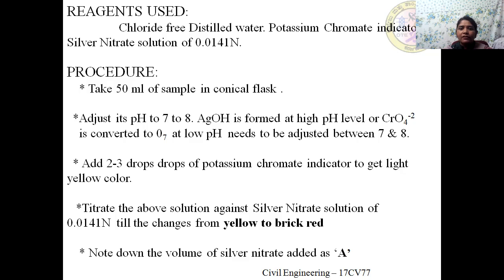The excess titrant reacts with the indicator and we come to know the color change, the end point. So an excess amount of titrant is used, which is known as the indicator blank correction. Finally, the titration of the blank test is subtracted from the original titration of the given water sample.